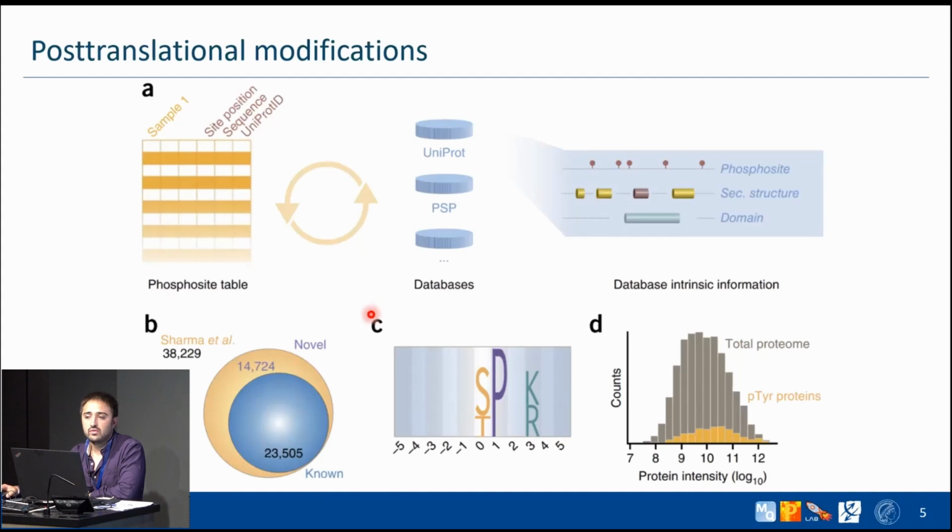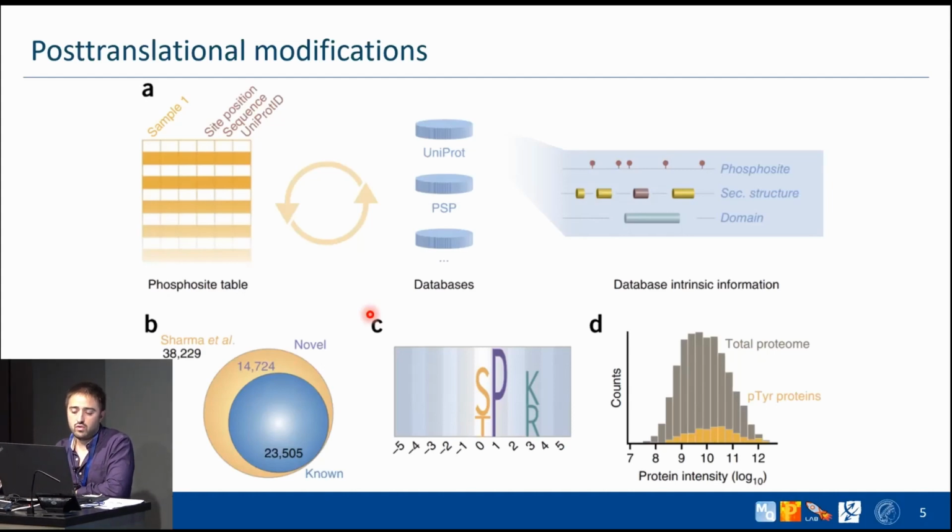You can also do motif analysis, meaning you define a center of your window, and then you also define a radius, and then you want to see which specific amino acids in every position will be more useful for activating this site that is in the center of the window. Exactly, and then you can also do normal visualization and imputation for this type of data.